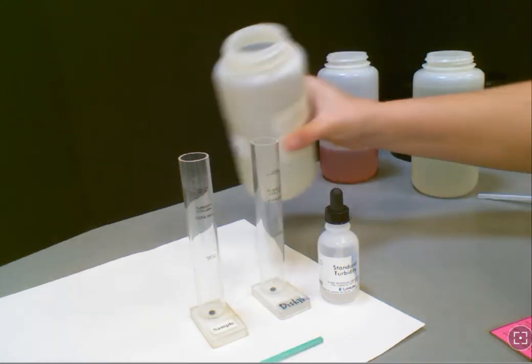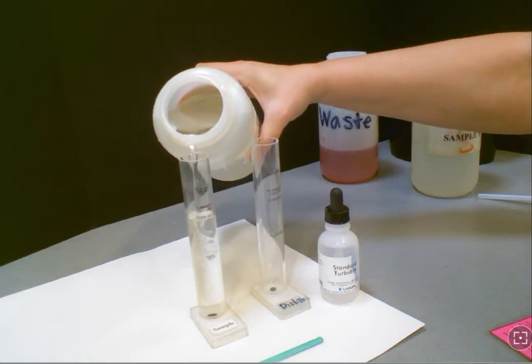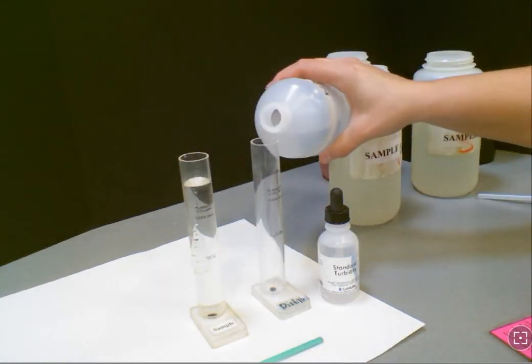So you're going to go ahead and collect your sample water. It's helpful if you have marked both of your tubes, sample and distilled water. So we're going to go ahead and put 50 milliliters up to the line into the sample water container. And we're going to do the same with the distilled water container next to it.